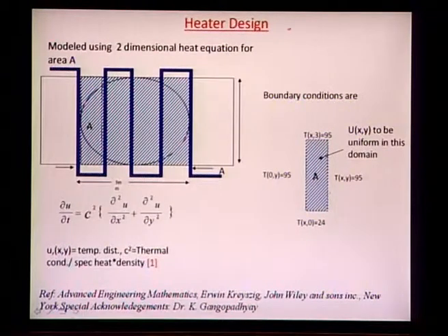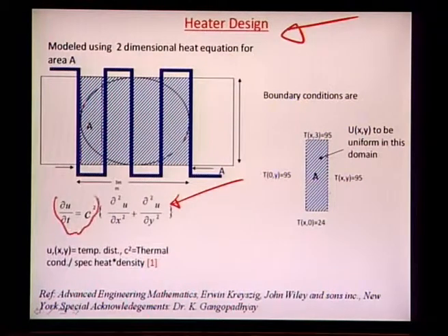This is how we designed the heaters, and this is very interesting how we did that. So, we used a 2-dimensional heat transfer model and essentially assumed the transients to be 0. Okay. So, du by dt was assumed to be 0 in this particular case for solutions, and we wanted to do so because PCR is really all about holding at a certain temperature step rather than trying to get to that particular temperature step.